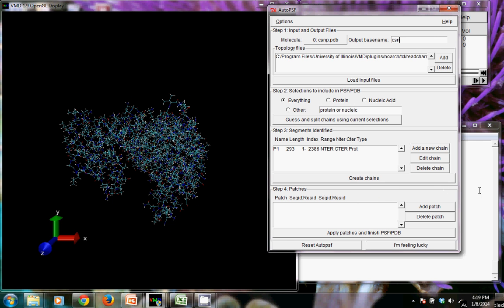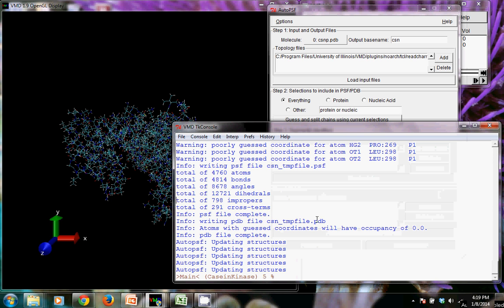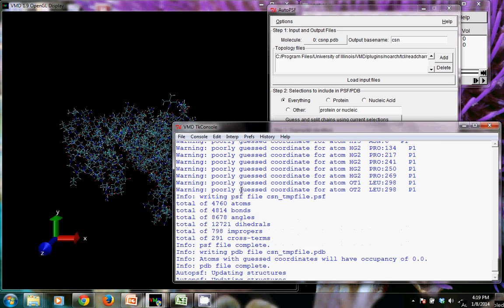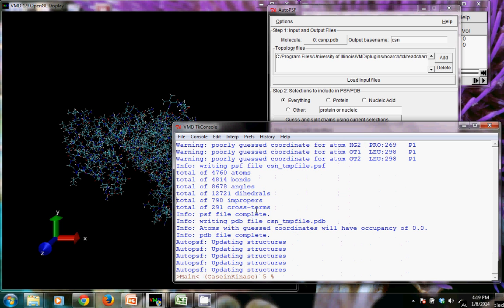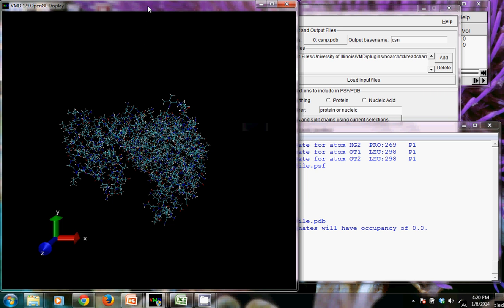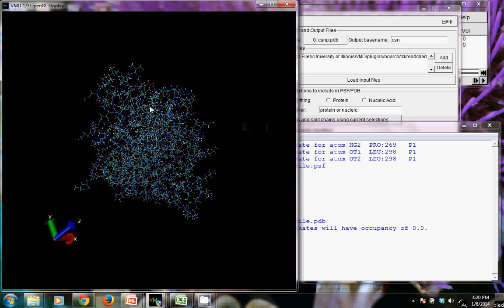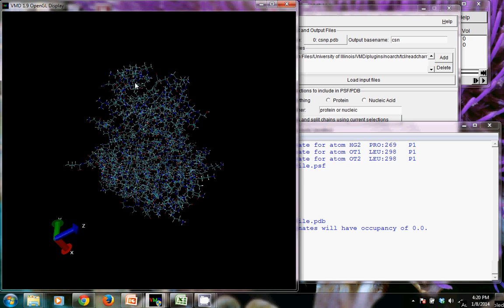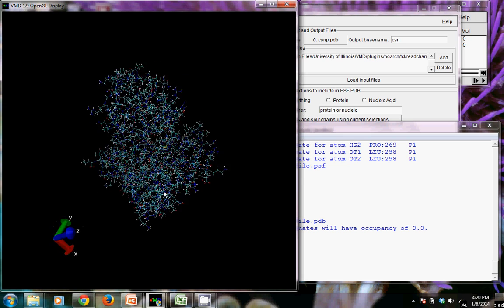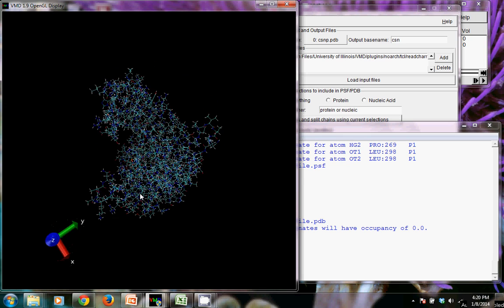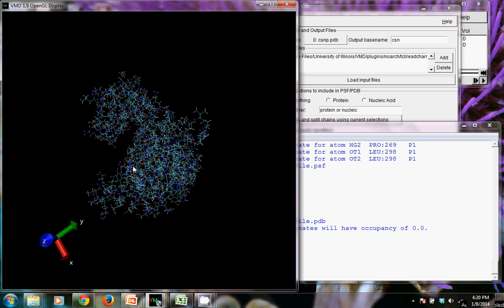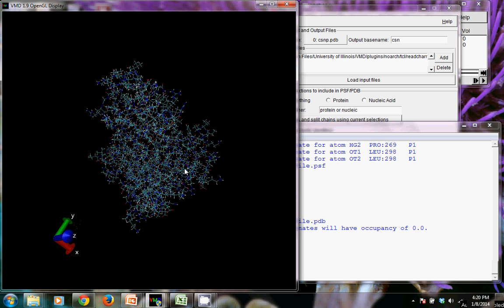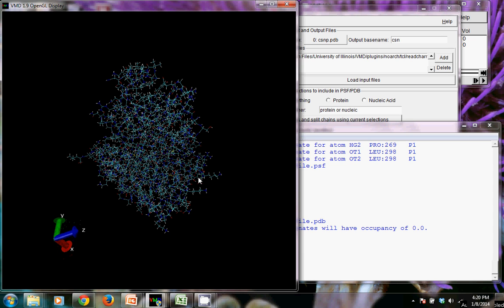I'm just going to click back here and quickly show you the TK console. It will tell you that it wasn't able to guess very accurately some of the coordinates, and that's fine. It'll give you totals for various things like atoms and bonds, and it'll tell you that it updated structures. And you should see that your structure was updated here if you left it in this default representation. You see that a bunch of white pieces show up on your molecule. Those are the hydrogens being added to your molecule as it creates this structure file.